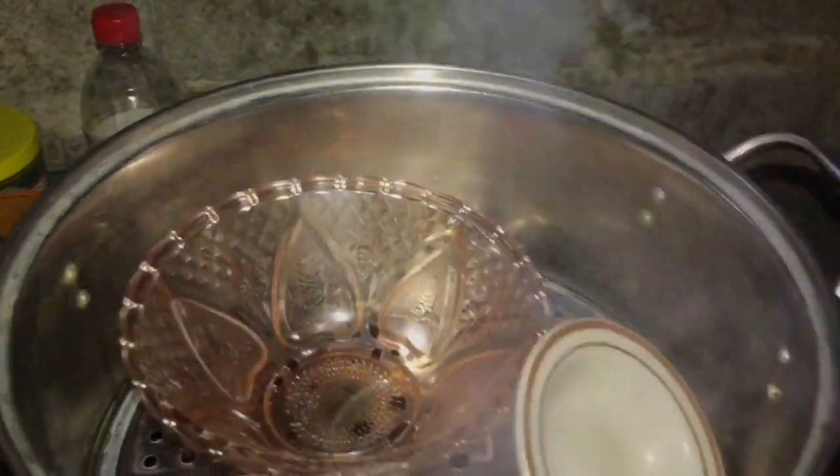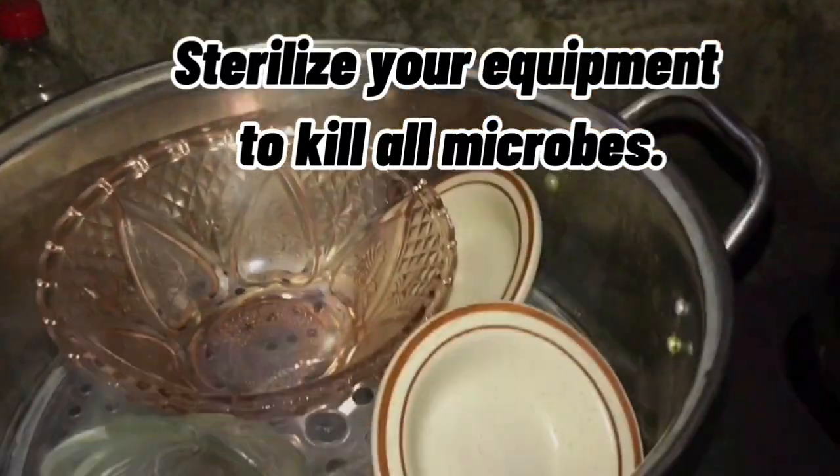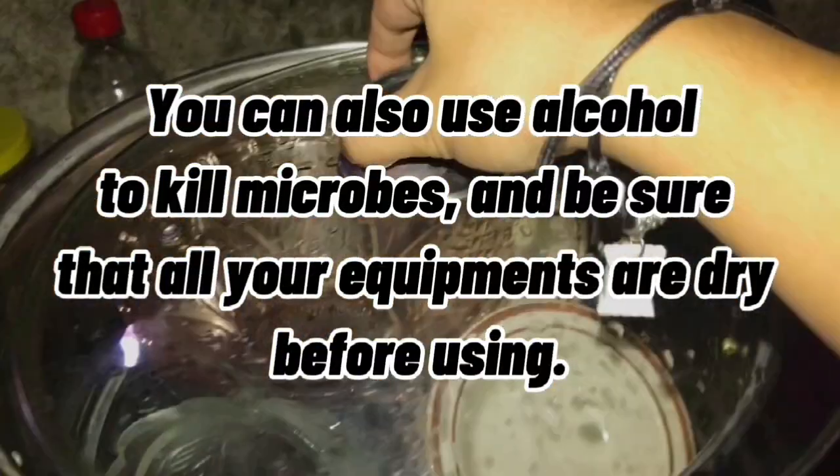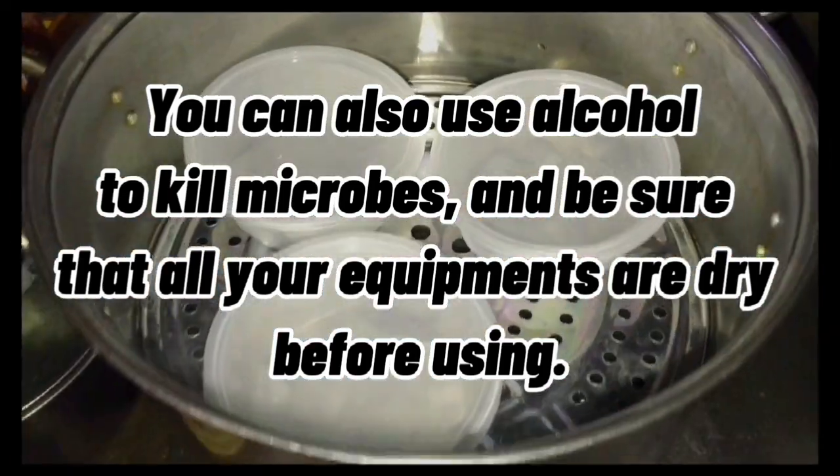Make sure to sterilize all your equipment before you begin to kill all the microbes. You can also use alcohol to kill microbes, and be sure that all your equipment is dry before you start.